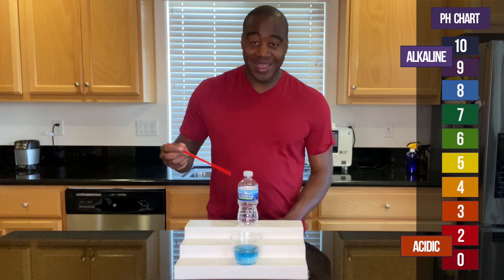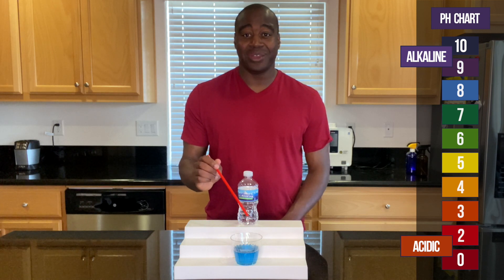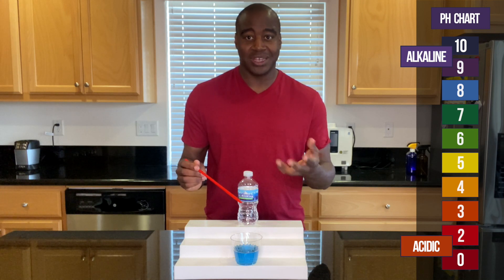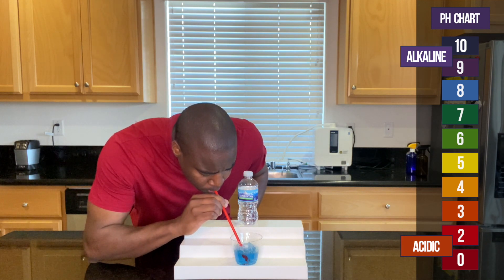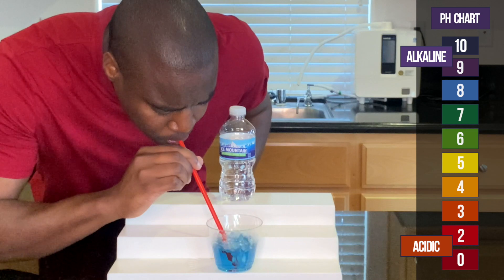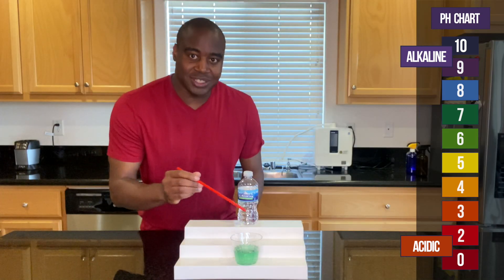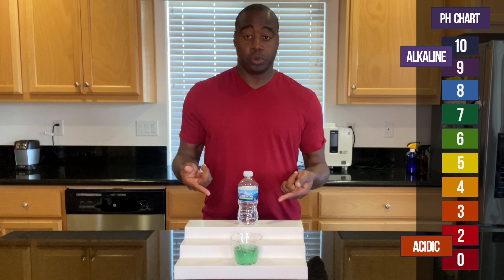All right. This is looking alkaline. So with that being said, I'm going to blow into it, see if it maintains that alkalinity — if it changes, what it changes to — just so you can see what happens when we actually give it the acidity from the stuff we're consuming. So it looks to me like it maintains neutral, which is great for spring water.